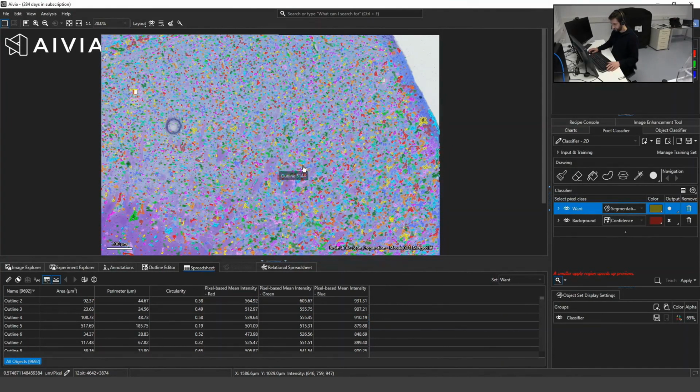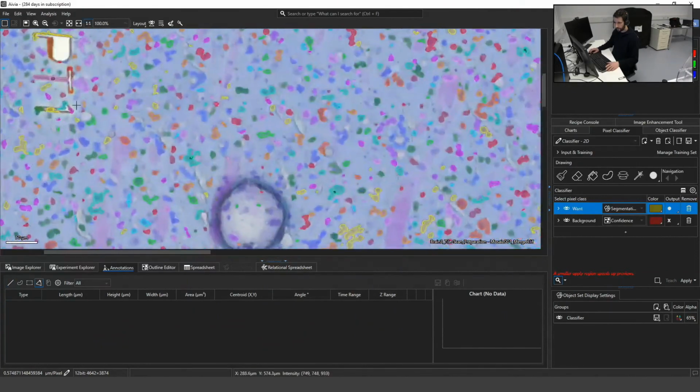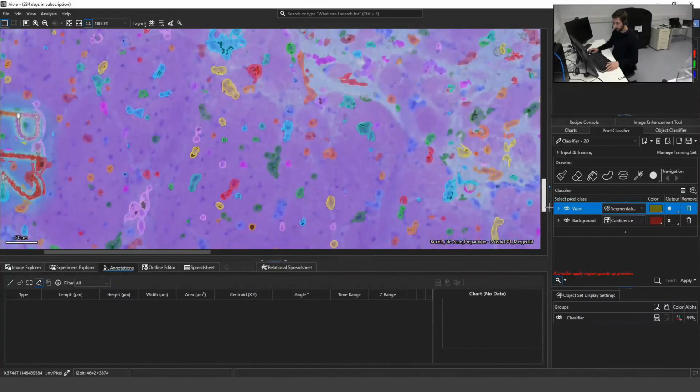What we have to do now is tell the system where my reference points are. For this, I use the annotation, and here especially the angle tool. Press the left mouse button, and now I go to the T of my reference point, because this is what I really identify as a reference point. Press left mouse button and go to reference point number 2, which is here.